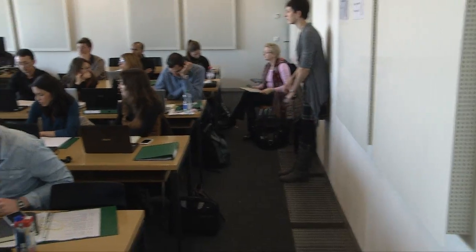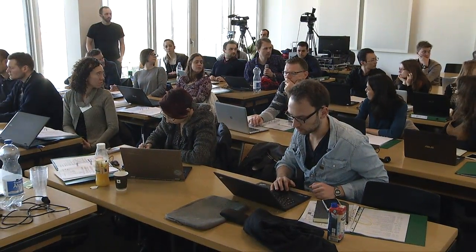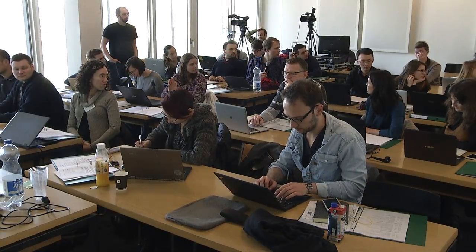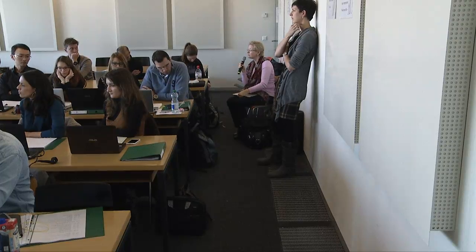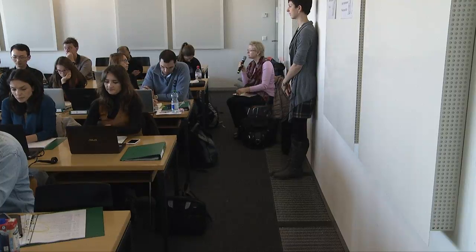So most raw data, what do you mean by the most raw evidence file? Yeah, I believe so. I don't remember the exact details, but we spent a lot of time taking as much low-level information as MaxQuant would give you. I don't know exactly what the file format is, but you can double-check all the information on the MSstats website.